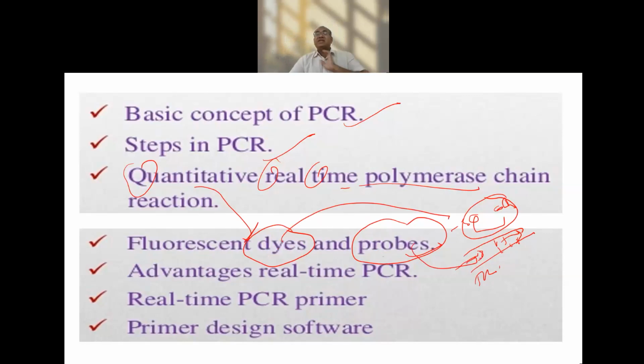probes, polymerase probes, are very important for us to have the sequence of that particular nucleotide placed in that particular part against that nucleotide. Like I have a guanine, which pairs with cytosine. I have an A, a T, or a U, an A. So this sequence which is placed, you learn in molecular technology, you could have some knowledge from CBSE and even the intermediate level also. Then we have some primers.